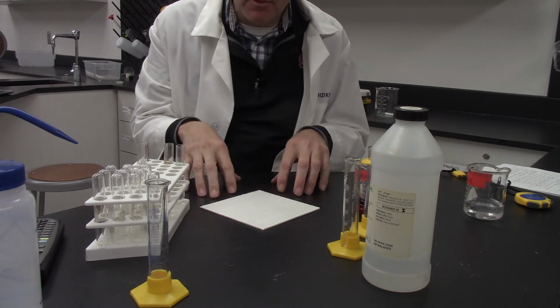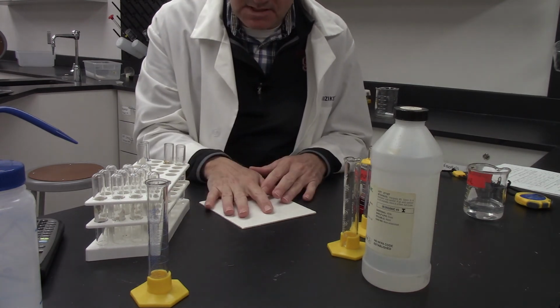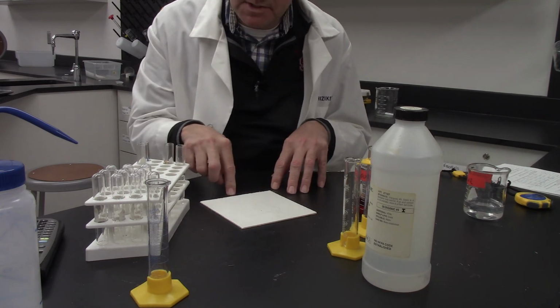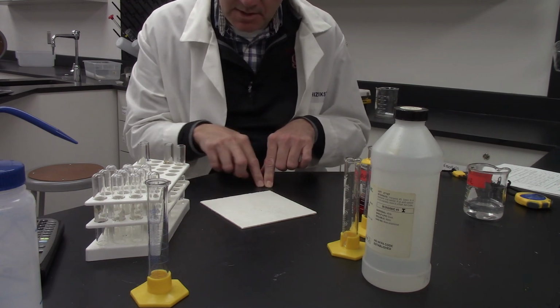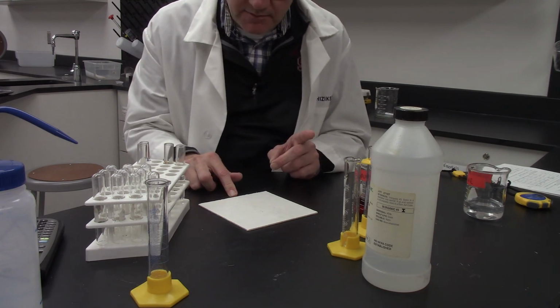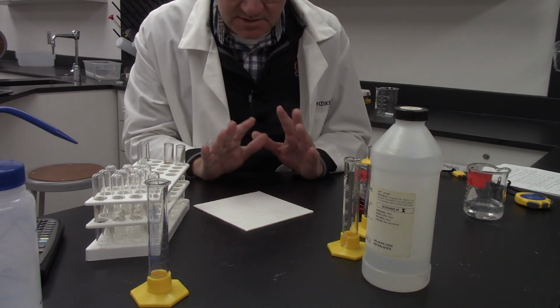What we're looking for eventually is the activation energy. I'll take you through the actual process in the lab. I'm going to plot 1 over the temperature in Kelvin on the x-axis, like on that assignment you just had on Thursday. We're going to put the natural log of k on the y-axis. We're going to get a graph, find the slope of that graph, and use that to calculate the activation energy.